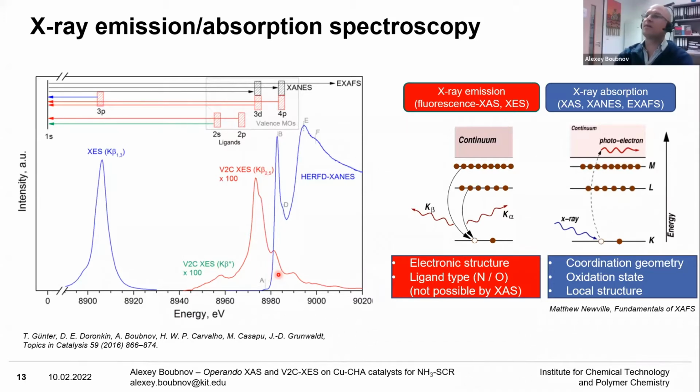Okay, I have not really thought about how the two relate to each other in terms of exactly that they're complementary, that one has a maximum while the other one has a minimum. But okay, I would check that by calculations to see. Sure. Again, it has to do with finite sample thickness. Okay. Laura has a point that maybe core hole potential can shift the spectra. I don't know. It would be an interesting thing to talk with the theorists about. Definitely. Seeing no other questions, you should continue, please.